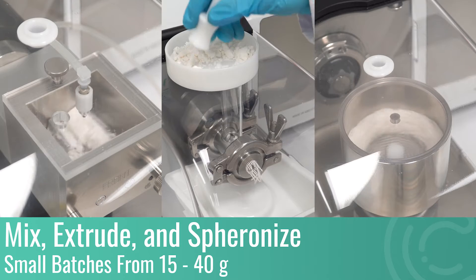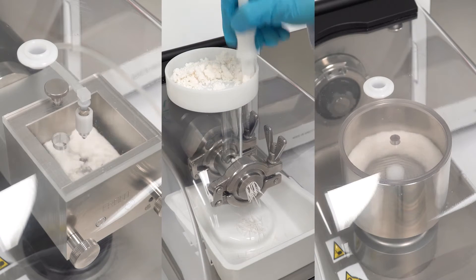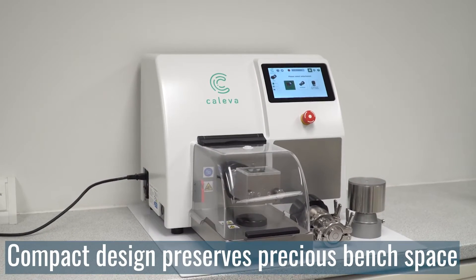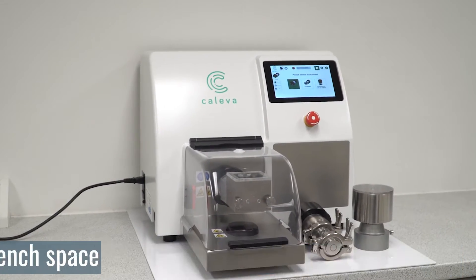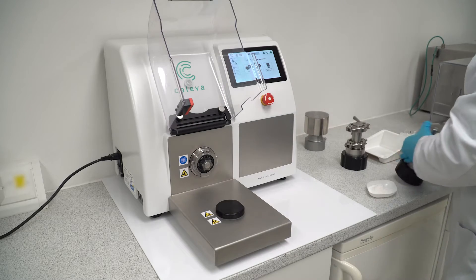Mix, extrude and spheronise small batches from 15 to 40 grams in a single benchtop unit. The Multilab Scientific has a compact design which preserves precious bench space whilst simultaneously saving time with an easy-to-use control interface and rapid experiment turnaround ability.